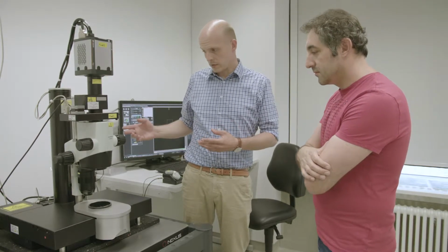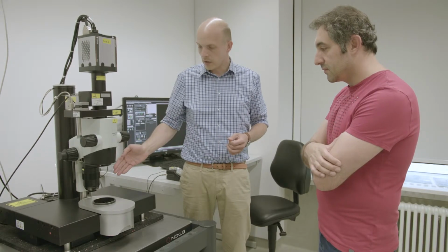The cool thing about the system is that we have a zoom body here. So if you have a large sample, you can have an overview of your sample, then you find your region of interest, and you just turn this knob, and you're directly in the region of interest with cellular resolution. That is the nice thing. And when it comes to clearing samples, you can use all the different clearing protocols which are available by now, and also the organic clearing protocols. Okay.